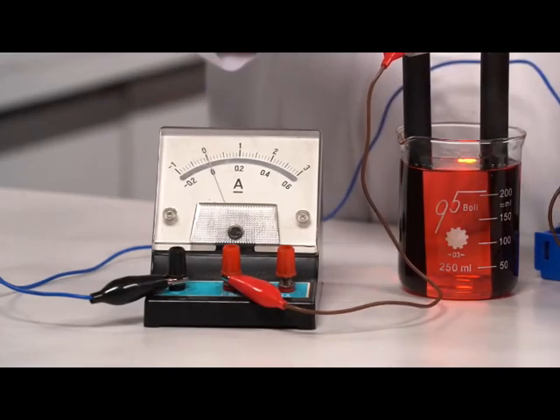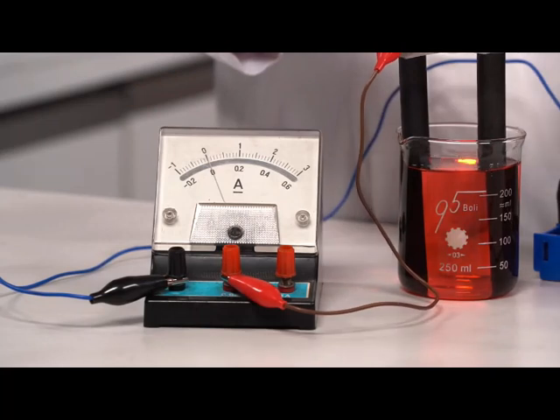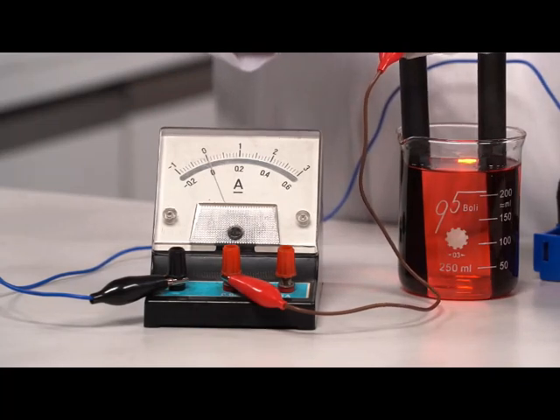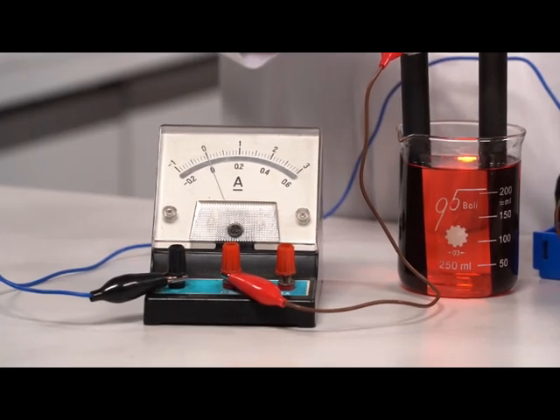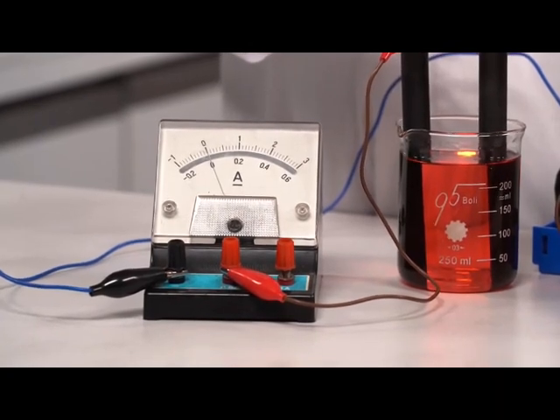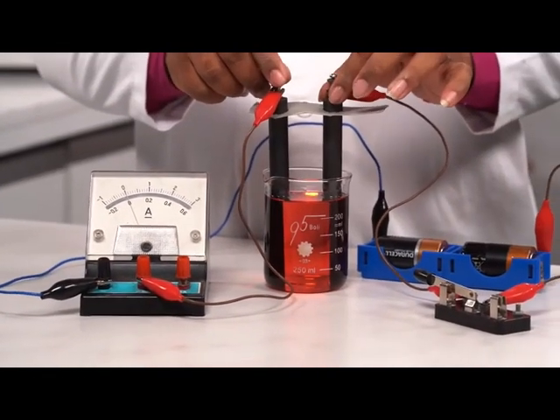Once again, let's turn off. Now it's off. Check, there is no deflection. Now once again we'll turn it on. No deflection once again. No matter how much we turn it on and off, there is no such deflection like in the previous two cases, my dear children.